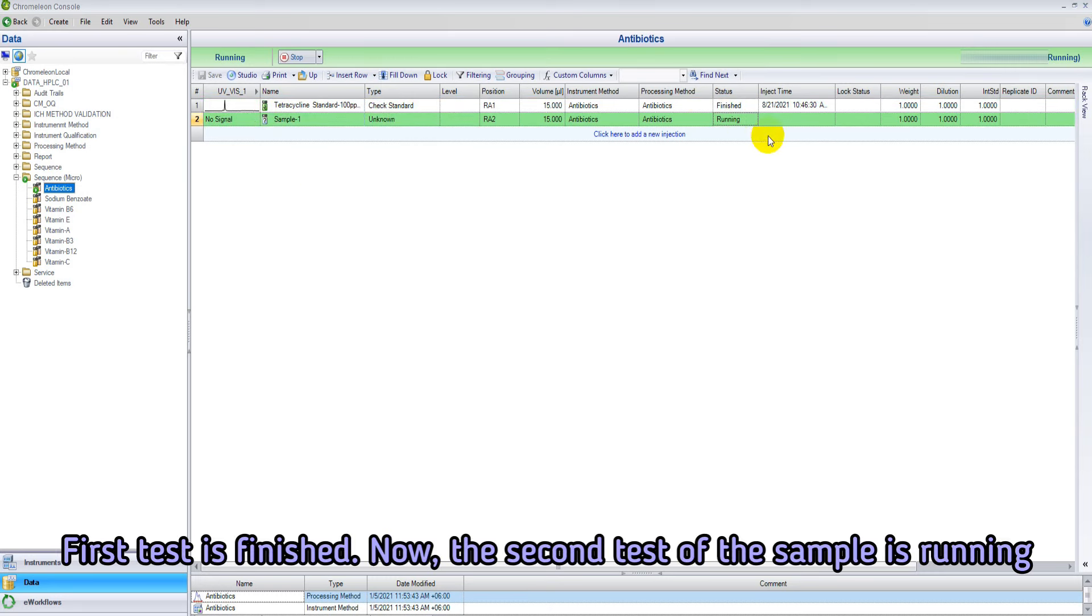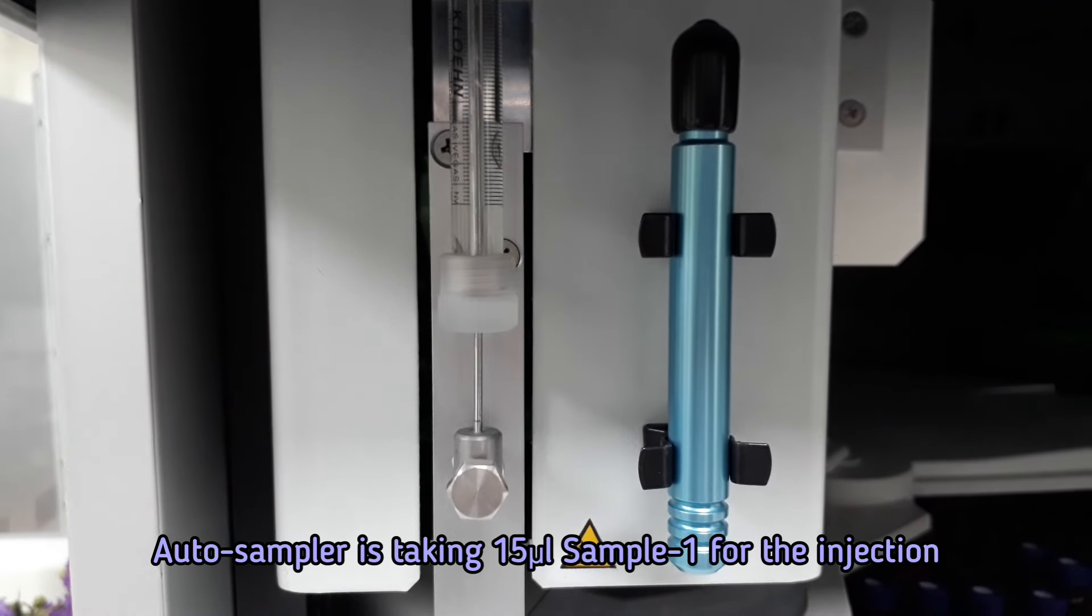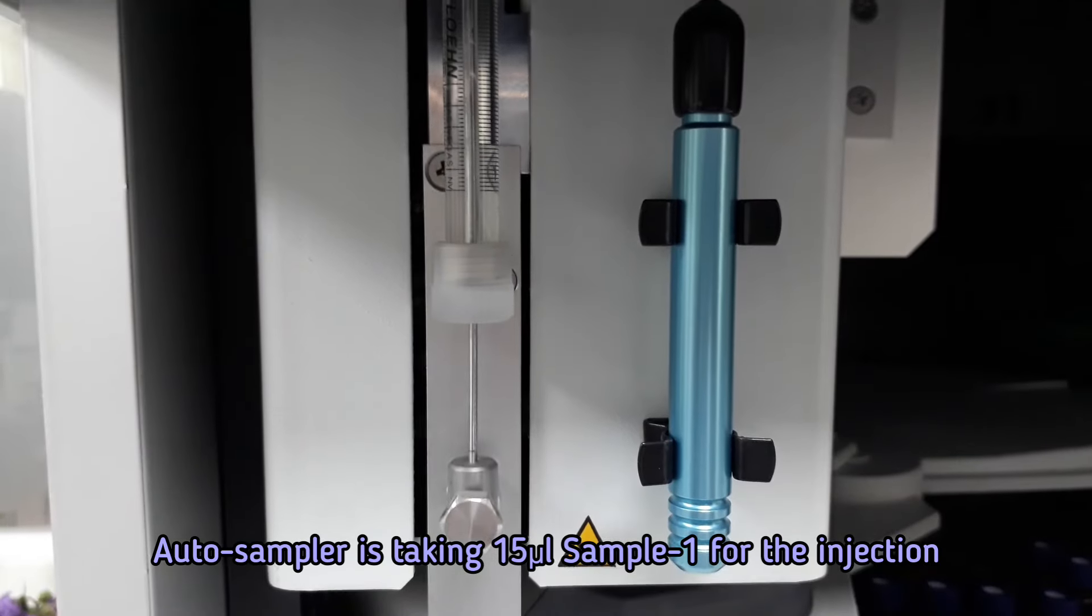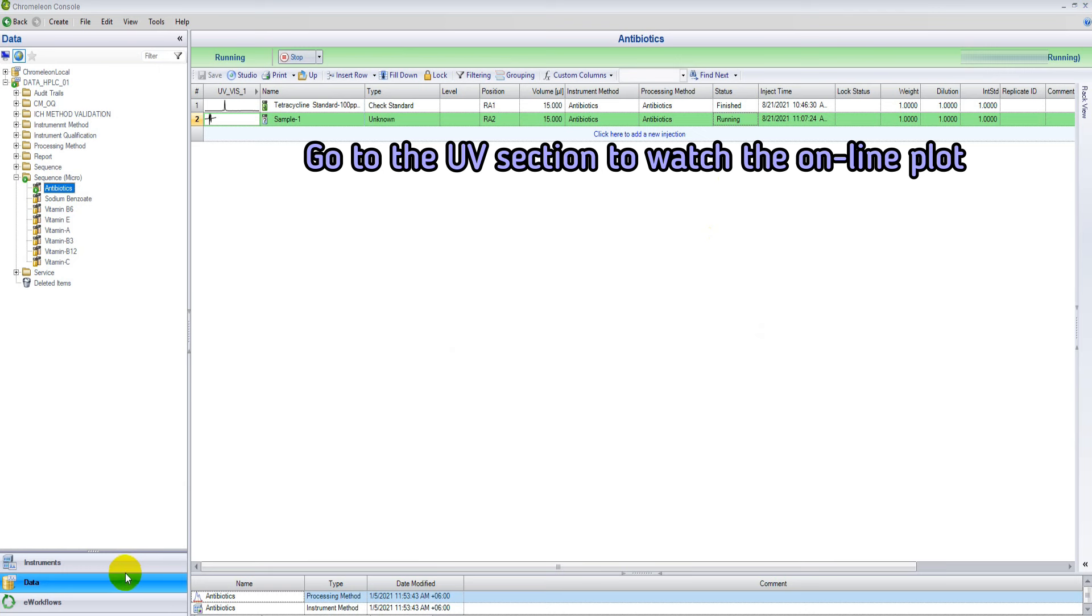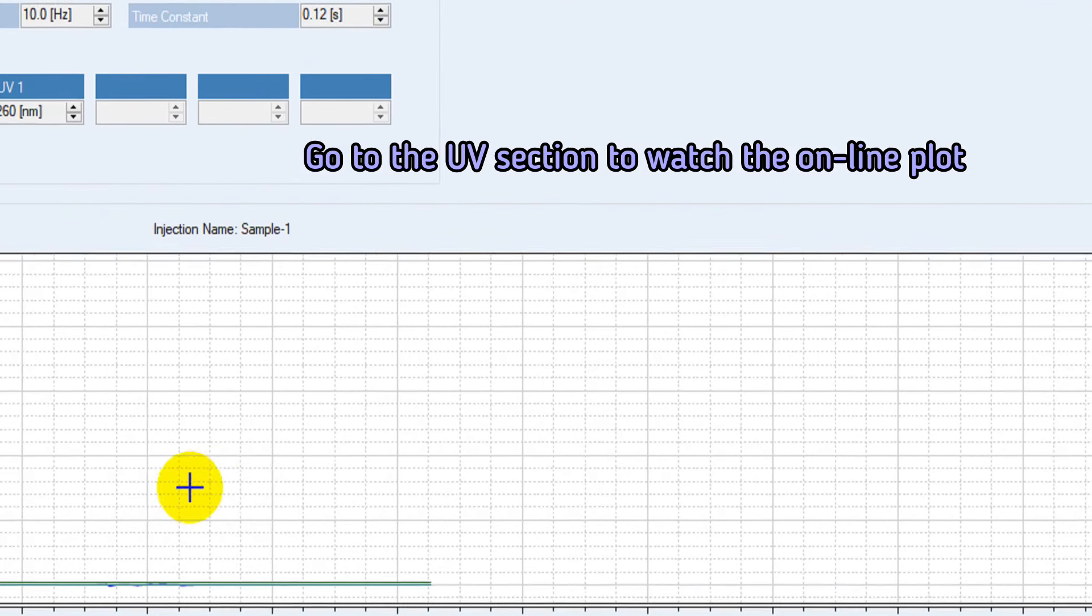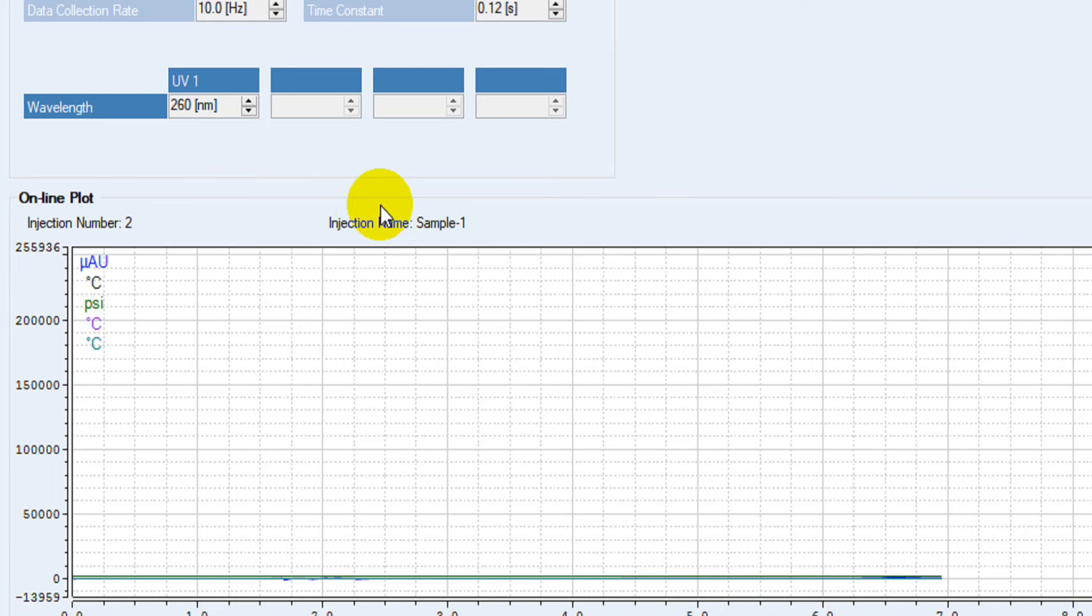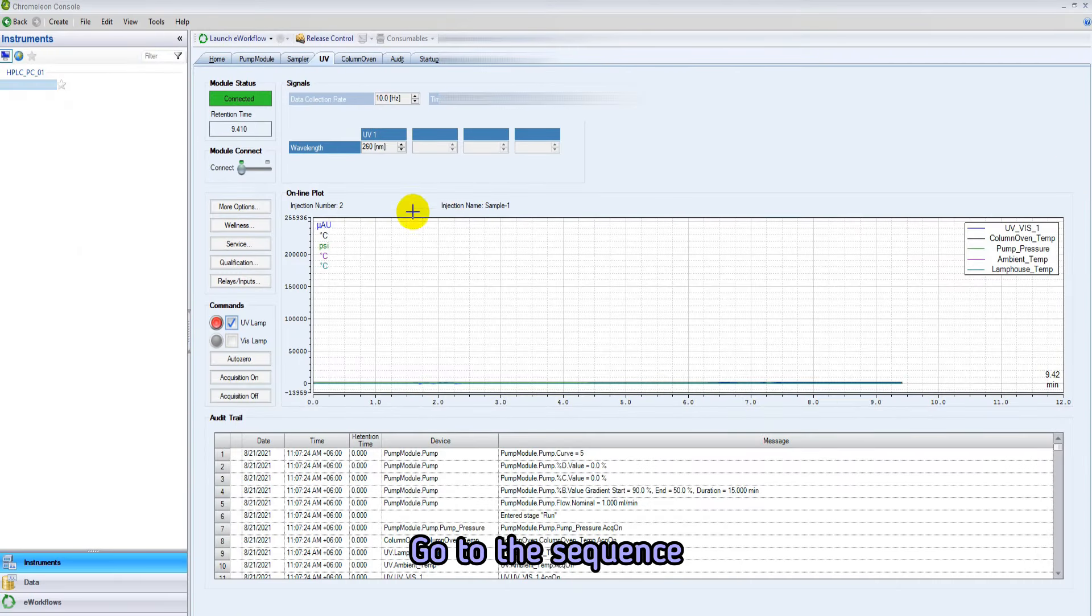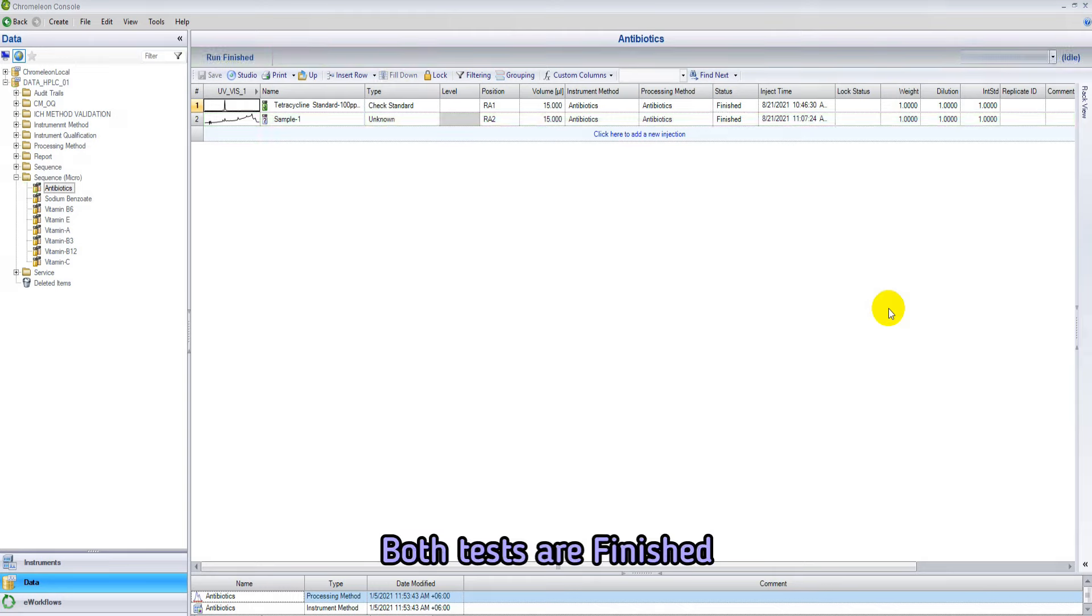Now the second test is running. Auto sampler is taking 15 microliter of prepared sample from the selected position RA2. Go to the UV section to watch the online plot of our sample. We are looking for the detector response at 7.2 retention time. No major peak is shown here. So we have to search the antibiotic peak in the chromatogram. Both tests are finished.